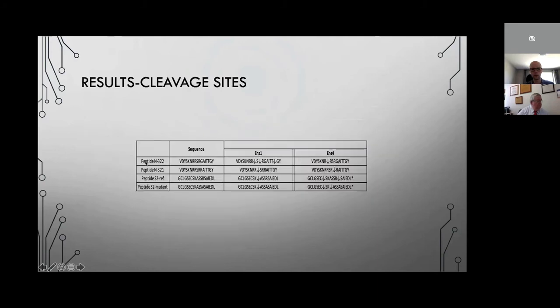So the other important thing we were able to look at is that, yes, there's that introduction of that multibasic residues. And if we look at 2 different enzymes, and we look at those multibasic residues, you could see that for some enzymes, it's actually able to cleave at different positions in those sites.